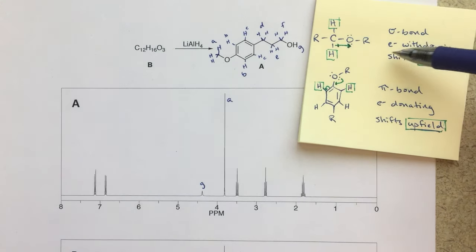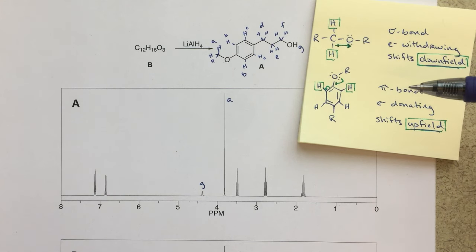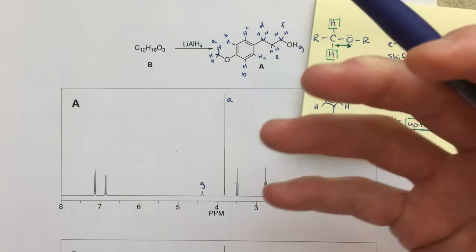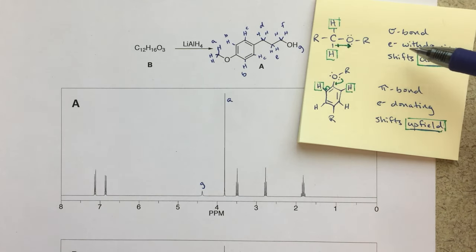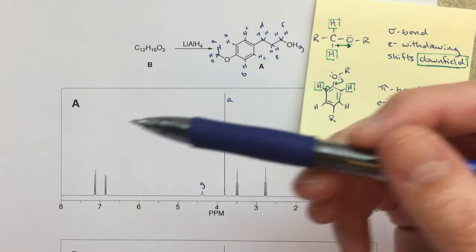A lot of times when we're thinking about oxygen interacting with our protons, it's going to be withdrawing electron density, shifting our peaks downfield, but in fact in this case, it's going to be doing the opposite actually, and this sticky really explains what's going on there. So under our normal circumstances, that's what we see up here, a sigma bonded carbon with these hydrogens in the green boxes, this oxygen is going to pull electron density away, right? It's going to have a polar bond between the carbon and oxygen pulling electron density away, causing a shift downfield because we're going to be de-shielding these protons, and these peaks, this signal for these protons, that's going to shift downfield.